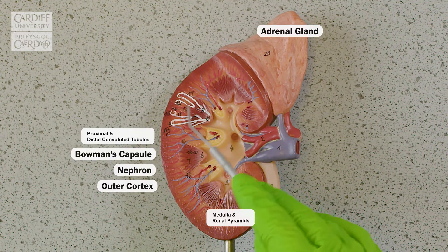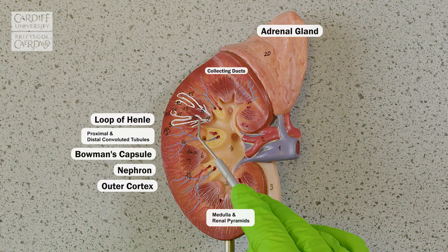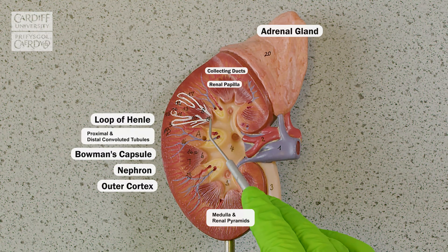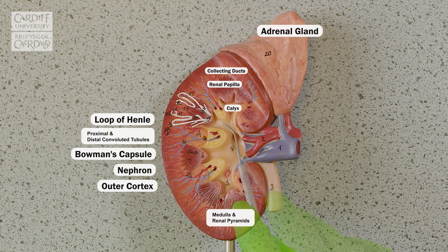Whereas in the medulla, you've got the location of our loop of Henle and our collecting ducts, which open out down onto the renal papilla — the very point of that pyramid — where our urine passes out, and into the calyx, going out from the calyx into the pelvis and then out through that ureter.